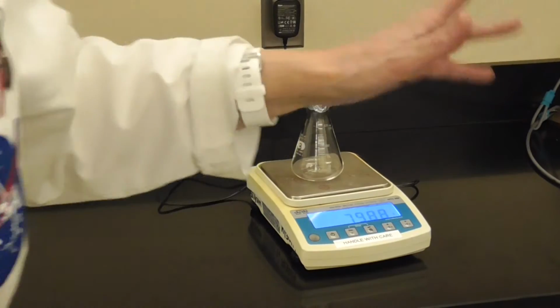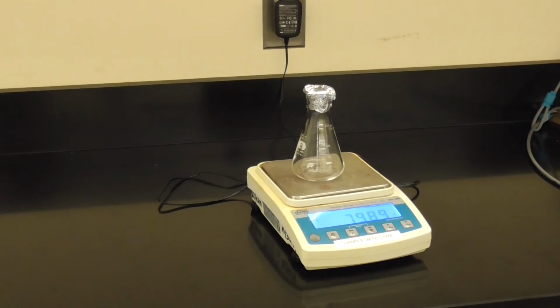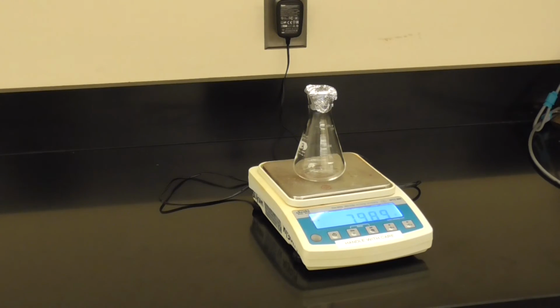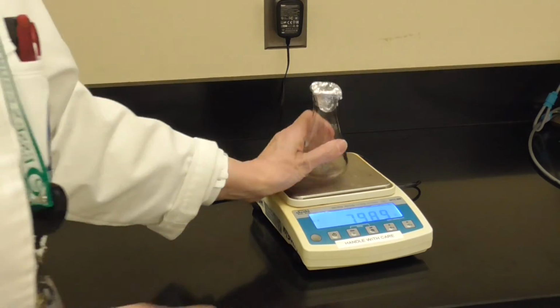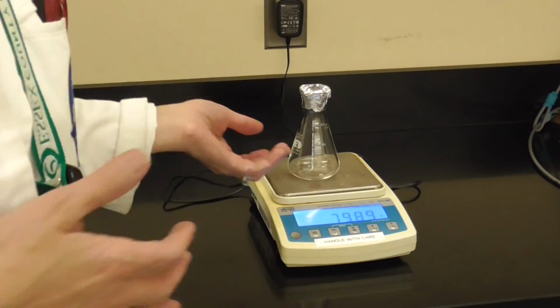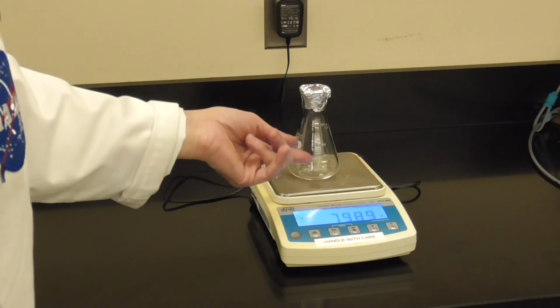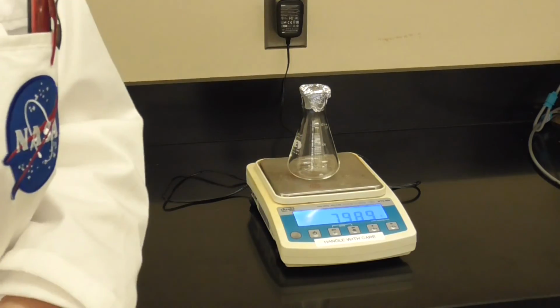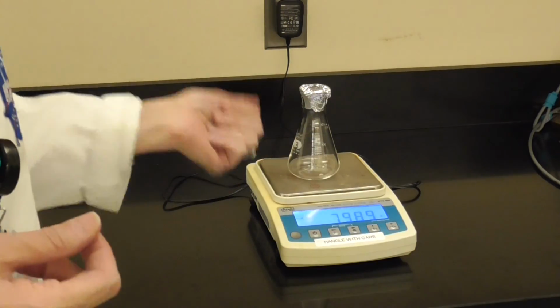Before we started, when it was empty, we also weighed the Erlenmeyer flask, the boiling chips, and the capped foil. After we condense the vapor of the volatile liquid, we make sure that it is cold, and then we weigh it again. We subtract the value of the container, and that will give you the mass of your unknown.